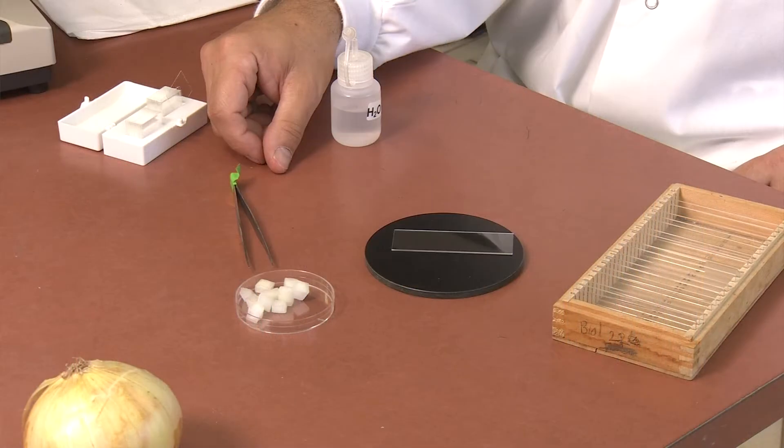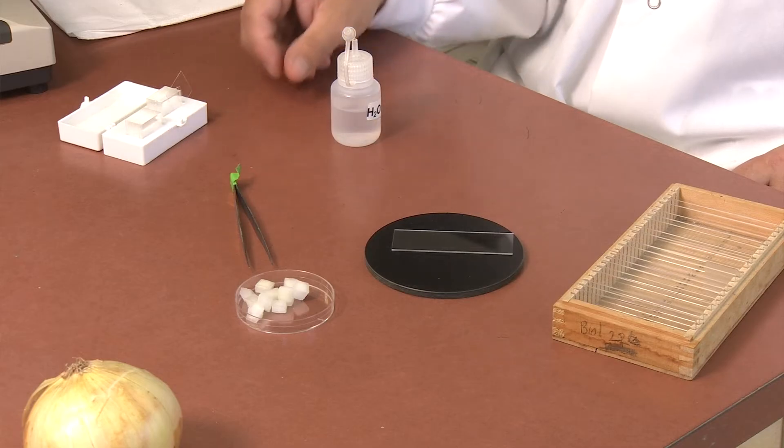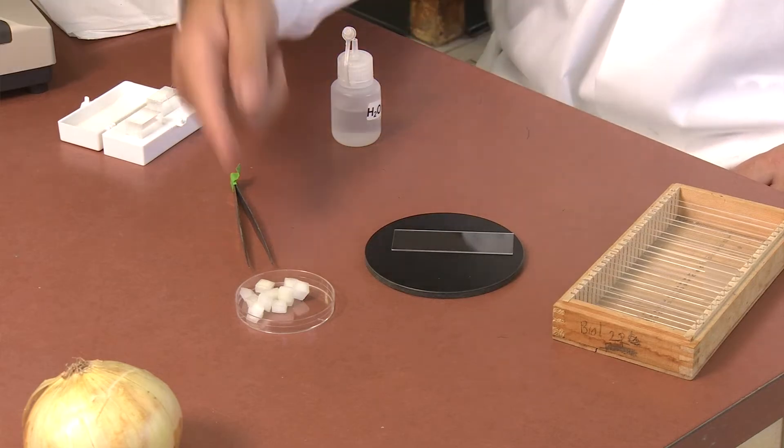In addition to slides and cover slips, you will need a piece of onion and fine forceps provided at the side bench.